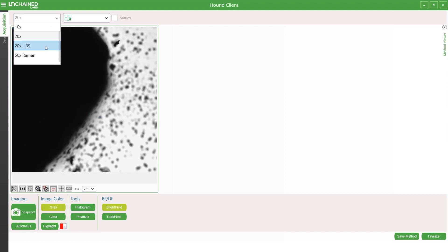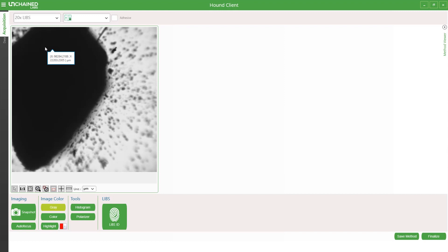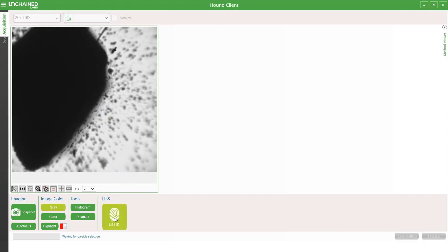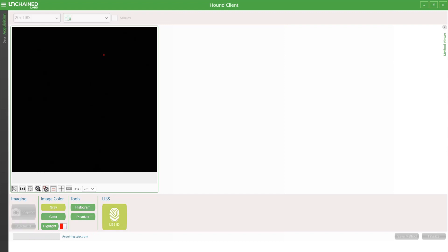Based on this, I'll use our laser induced breakdown spectroscopy, or LIBS laser, for identification. There are no settings, just a one second shot with this laser, and I should have a match. I can click on exactly where in the particle I want to try to ID. The LIBS laser is a lot of fun to shoot, actually — it ablates a small amount of the surface, which gives you the satisfaction of creating a small crater like this one here.